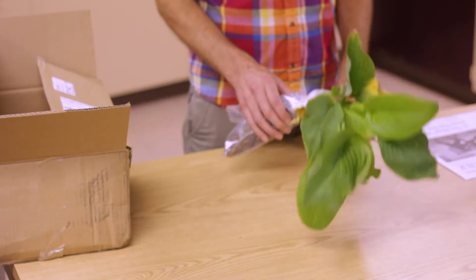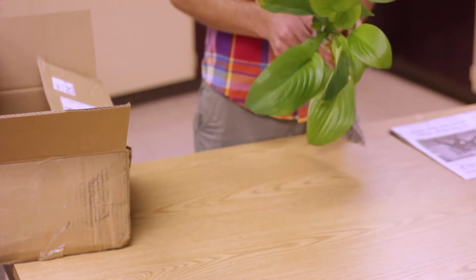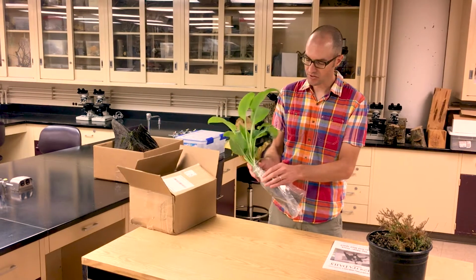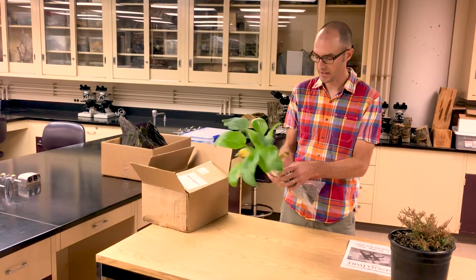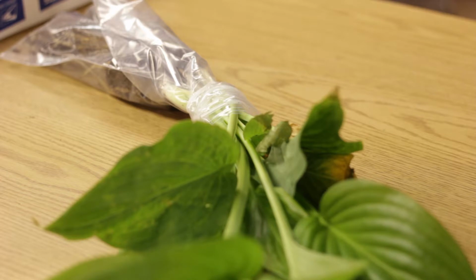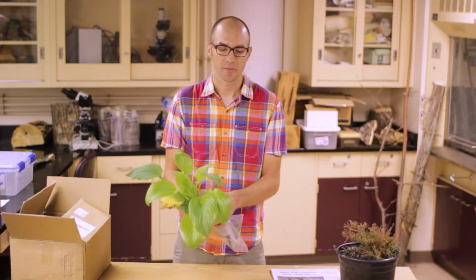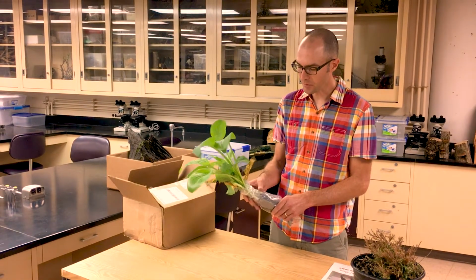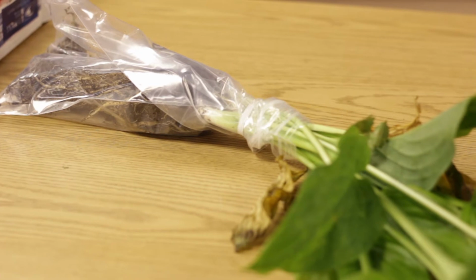Okay, so what I've done is I've taken the hosta out of the pot and I've shaken some of the excess soil off. And so I have put a plastic bag around where the roots are, and I have just tied that off with a little twisty tie to keep it nice and tight. The reason you don't want to put the whole plant sample in a plastic bag is you can get a lot of humidity that's going to collect in there, and then the sample is going to degrade pretty rapidly if it's in the post office for any length of time. But if you can wrap the roots off, that should prevent it from drying too much.